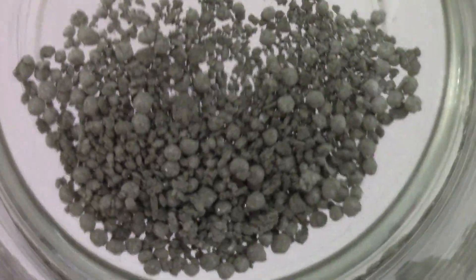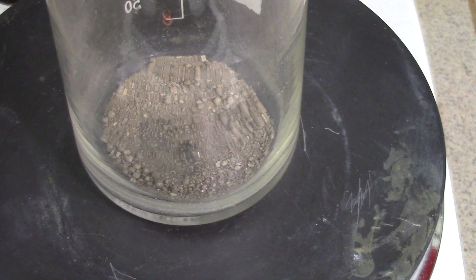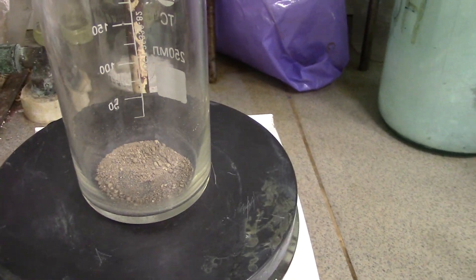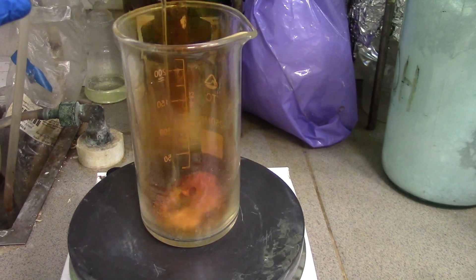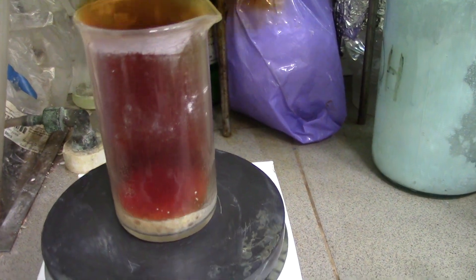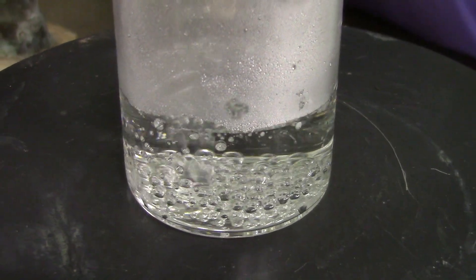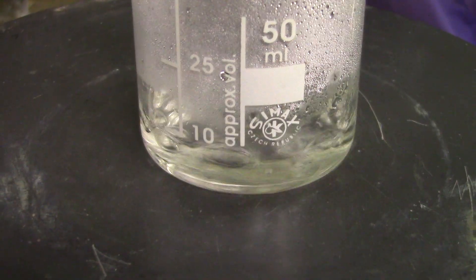Silver metal should be washed several times with water and dried right on a hot plate. In my case, I decided to dissolve it again in a stoichiometric quantity of nitric acid for making a small portion of ultra-pure silver nitrate. Such nice flakes of nitrate have formed.